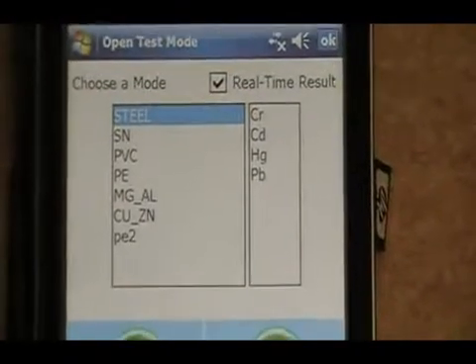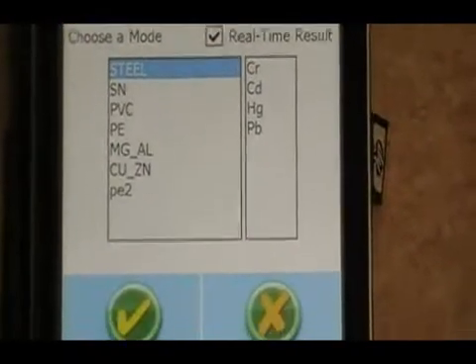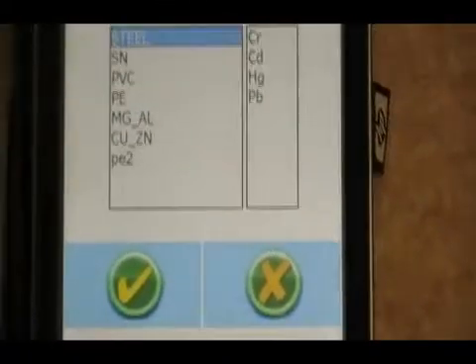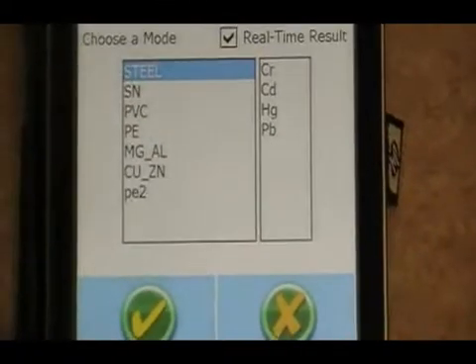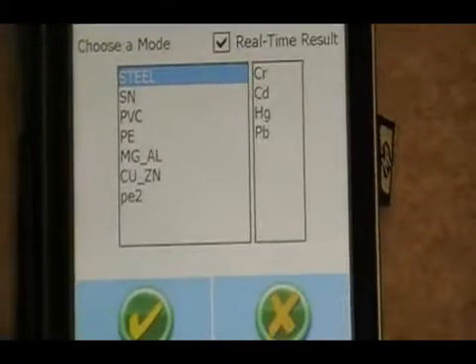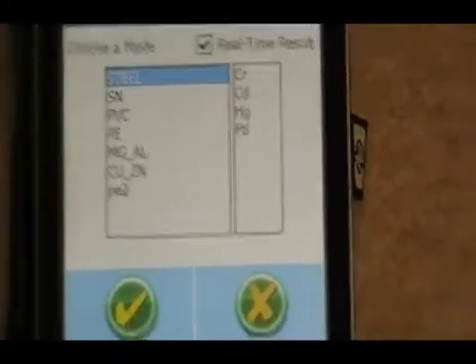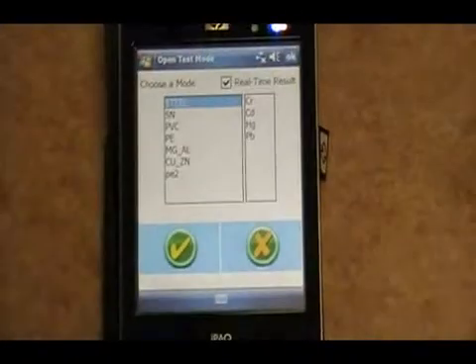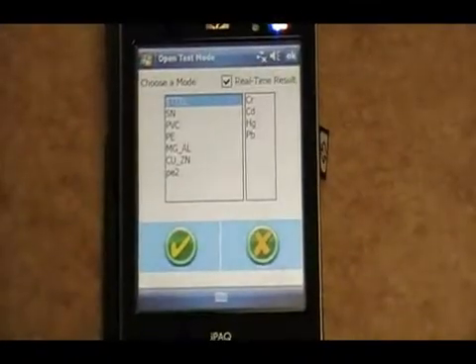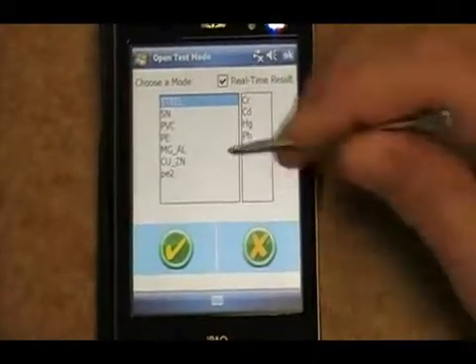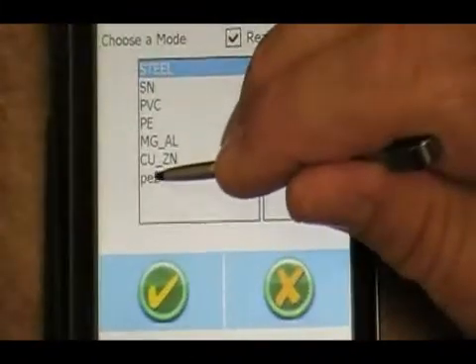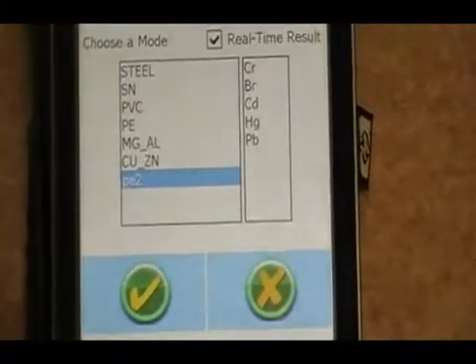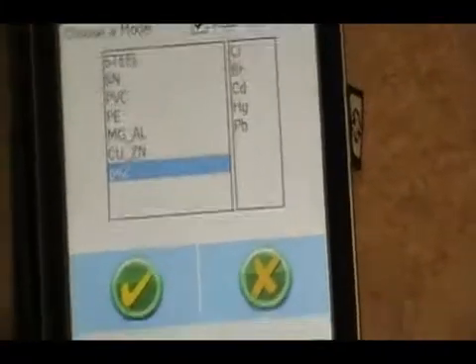What these are is substrates that solders may be on for lead-free testing and such. We also made a program for demonstration purposes called PE2. That's the one we're going to use for today with the curves that we have loaded into the machine.